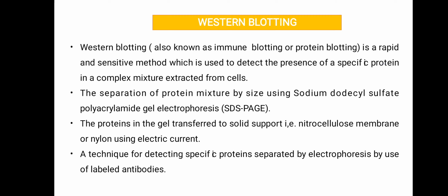The separation of protein mixture by size using sodium dodecyl sulfate polyacrylamide gel electrophoresis, SDS-PAGE. The proteins in the gel are transferred to a solid support, i.e., nitrocellulose membrane or nylon, using electric current.